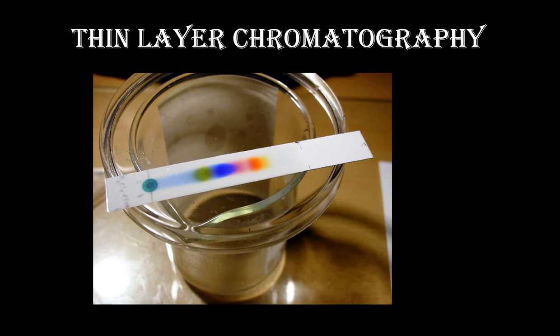Here the TLC plate is shown where the separation is carried out. We can observe the solvent front, and one spot greenish in color, and then the components get separated as the solvent system ascends the TLC plate.